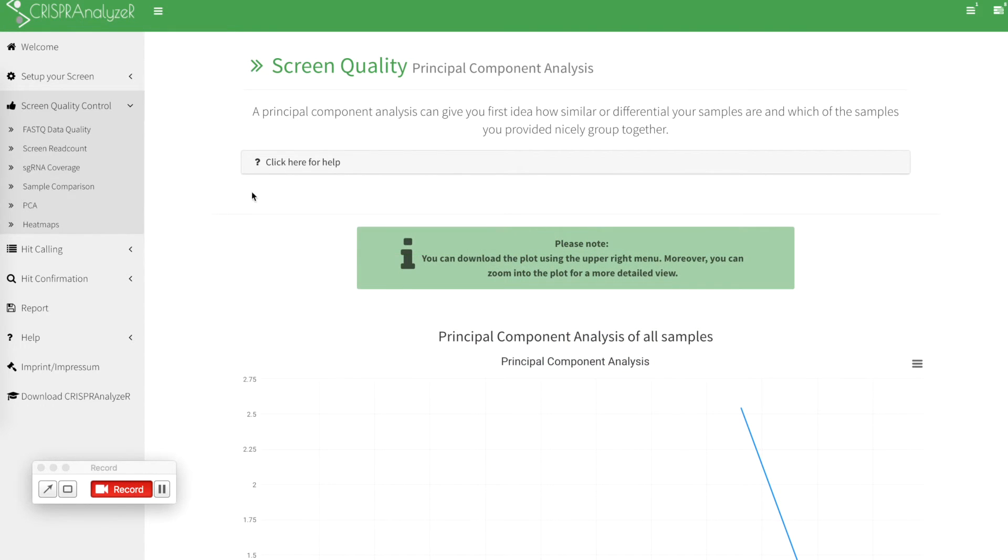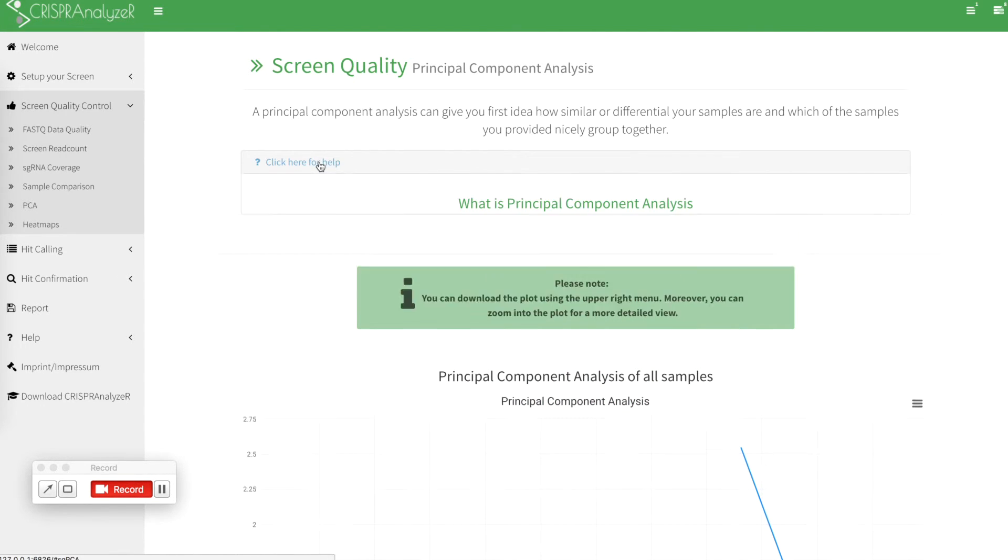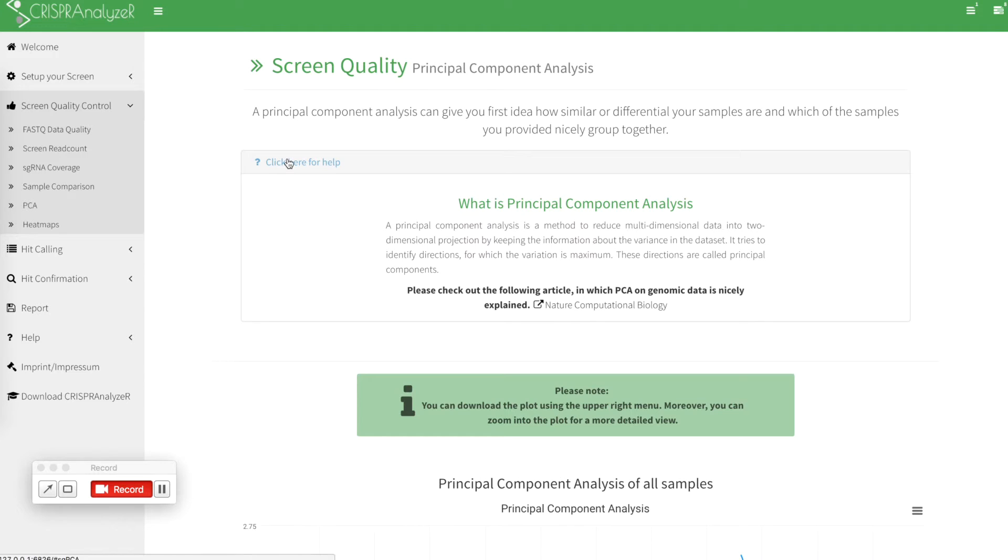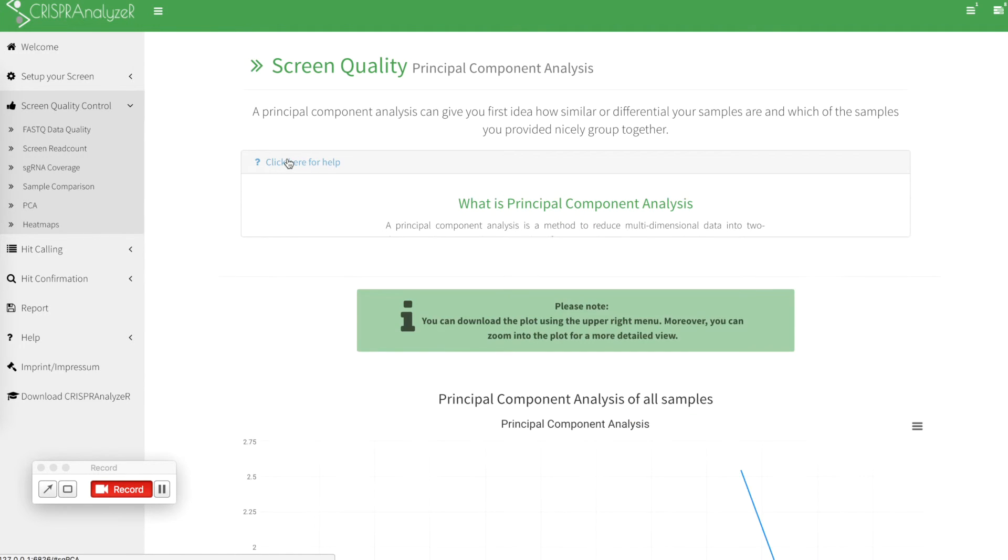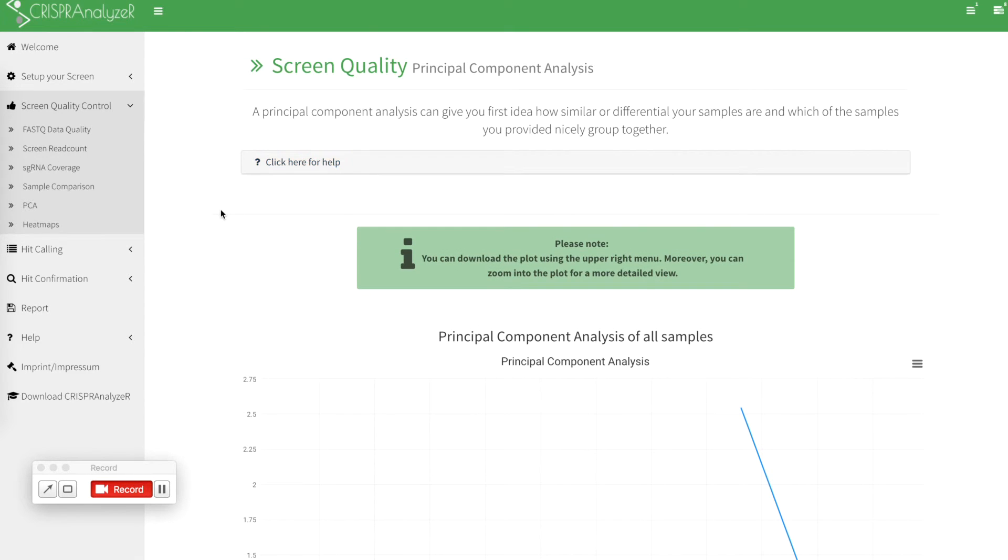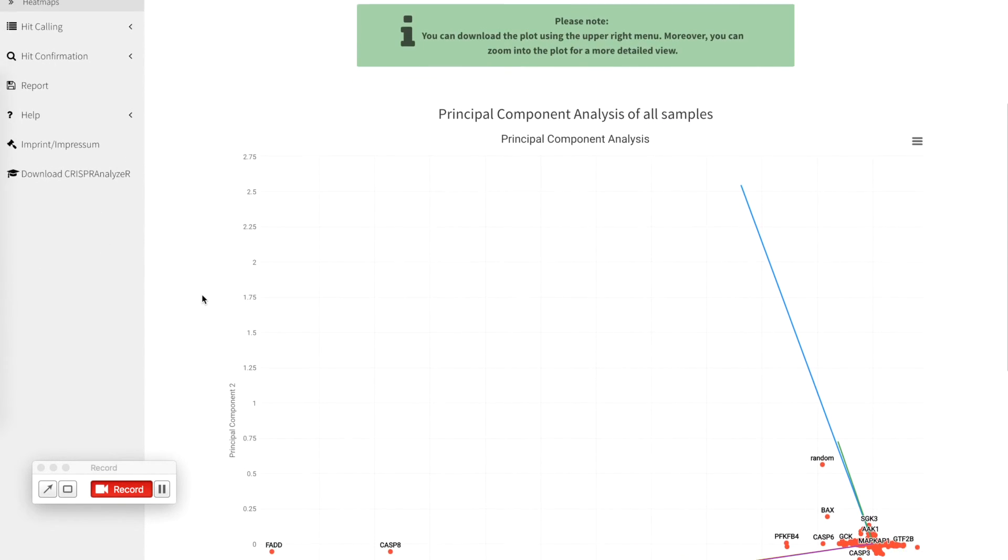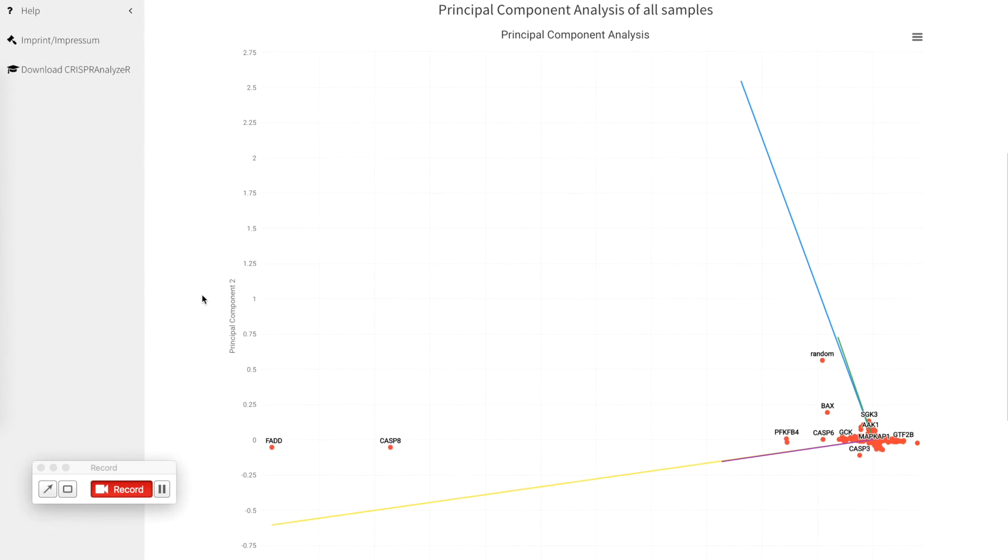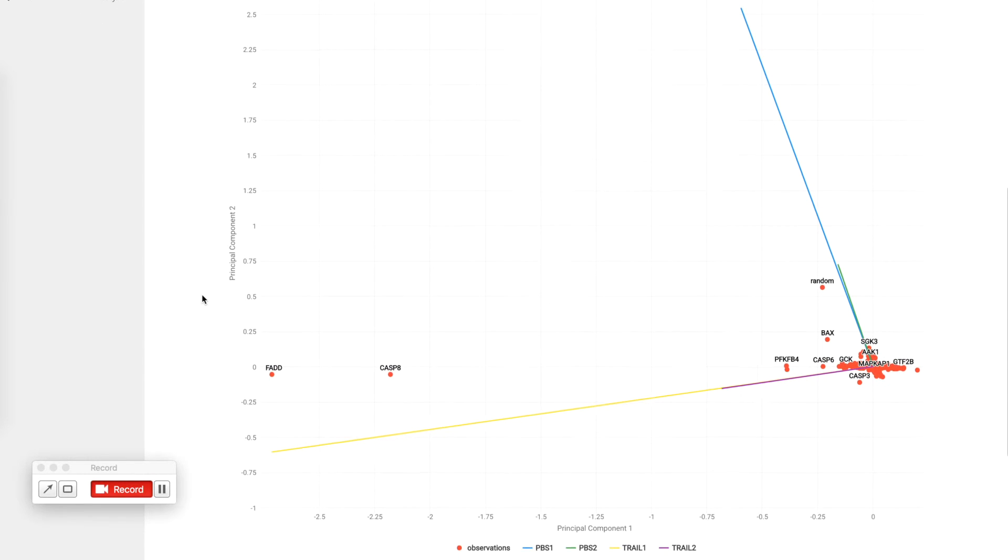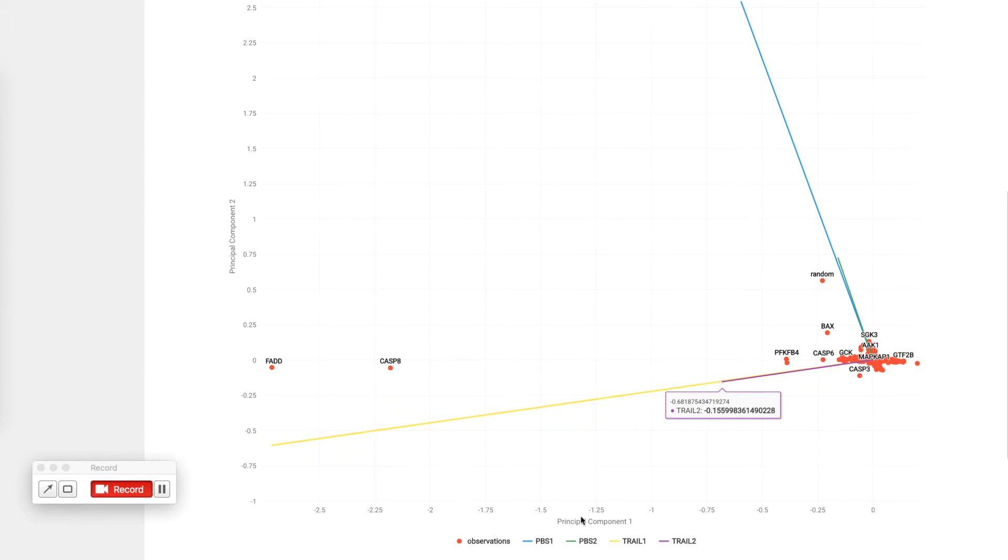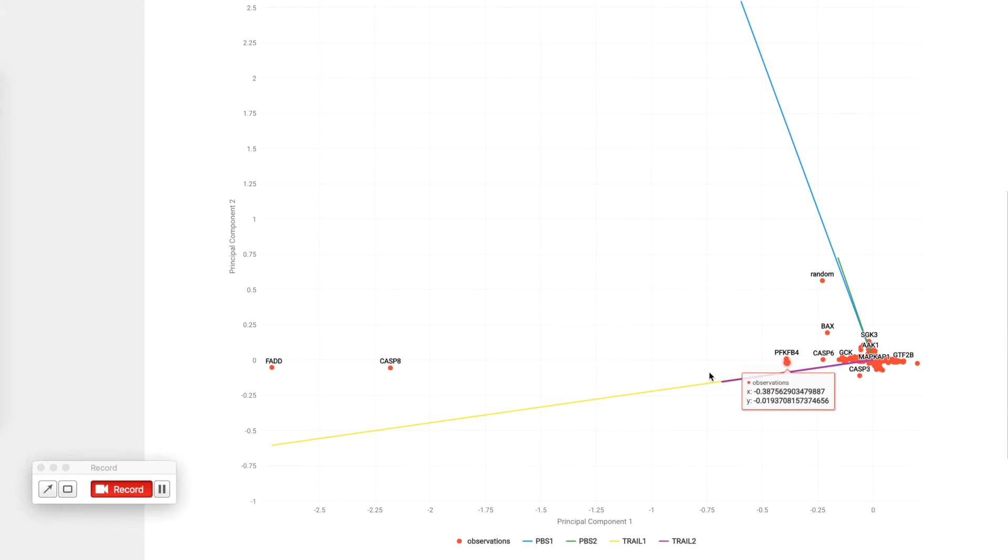As a next feature, CRISPR analyzer offers a principal component analysis. Click for the help to find the paper where it has nicely explained what a PCA can do on your data. The principal component analysis plot is shown here and it shows as trajectories your different data sets and observations as points.